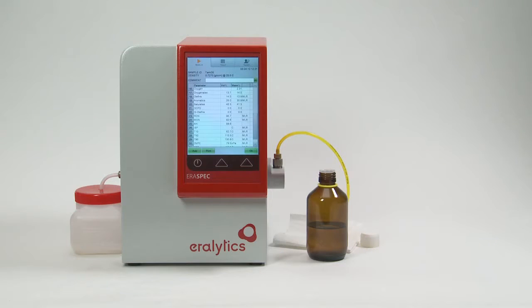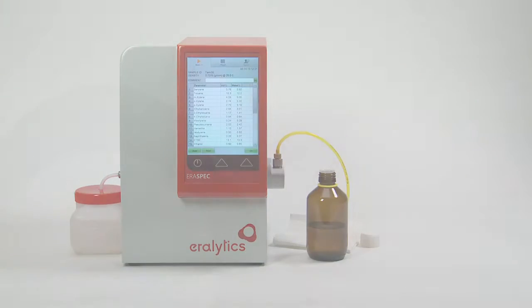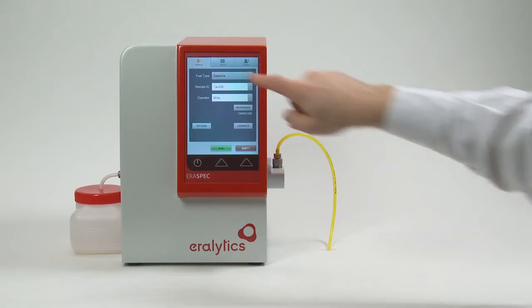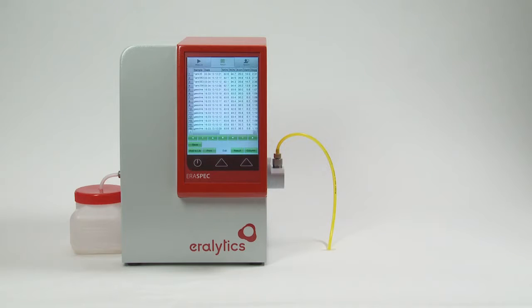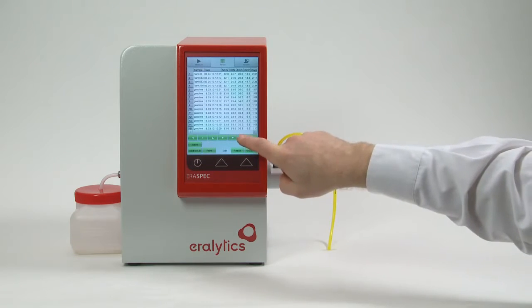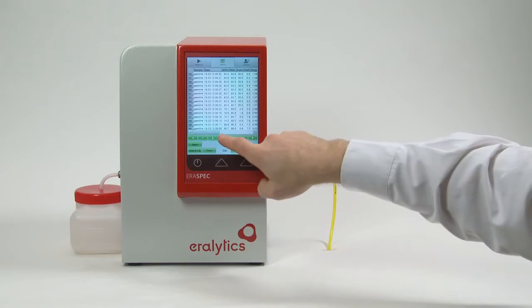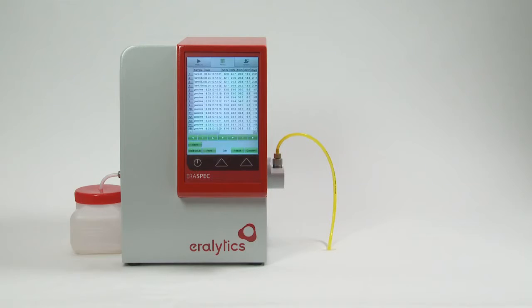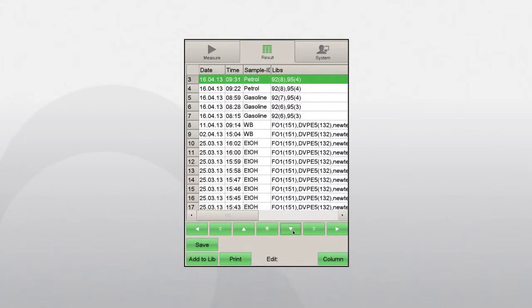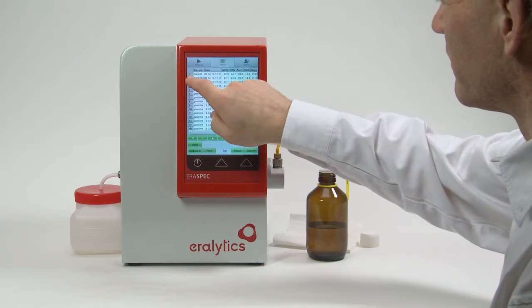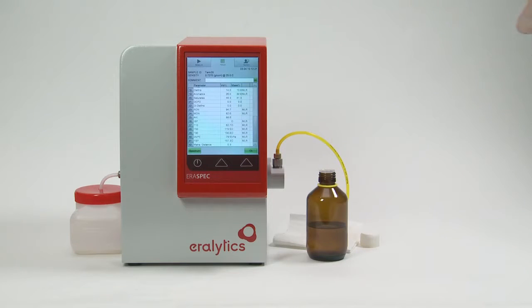You can browse the result list using the scroll bar on the right side. In the result menu, several thousand results can be stored and reviewed. Simply go to the result menu. Each line displays a result. Using the column button, you can select specific parameters you need to be shown. Browse through the result memory using the cursor keys at the bottom of the list. To view the entire result list of an older measurement, press the box to the left of the desired results.